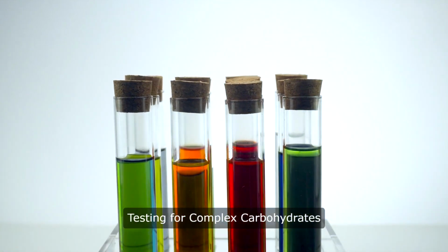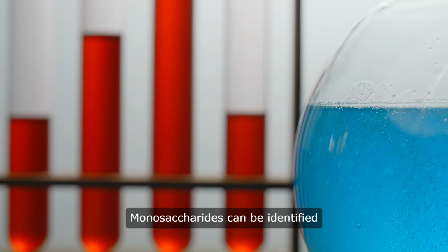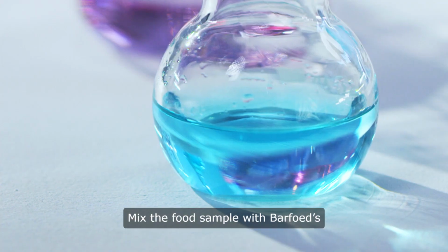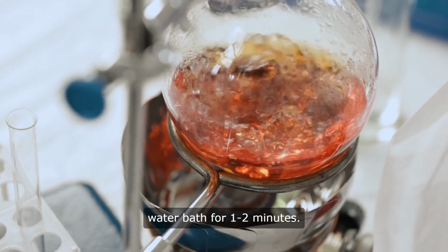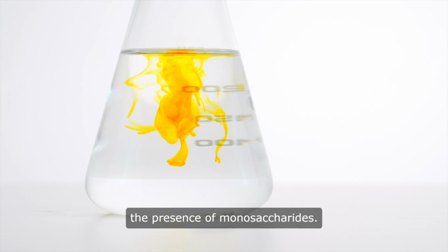Testing for complex carbohydrates. Barfoed's test for monosaccharides. Monosaccharides can be identified using Barfoed's reagent, which contains copper(II) acetate. The procedure for this test is: 1. Mix the food sample with Barfoed's reagent in a test tube. 2. Heat the mixture in a boiling water bath for 1 to 2 minutes. Observation. A red precipitate indicates the presence of monosaccharides.